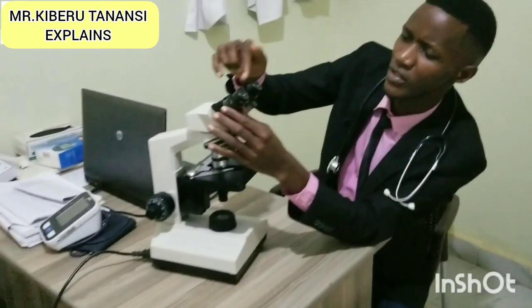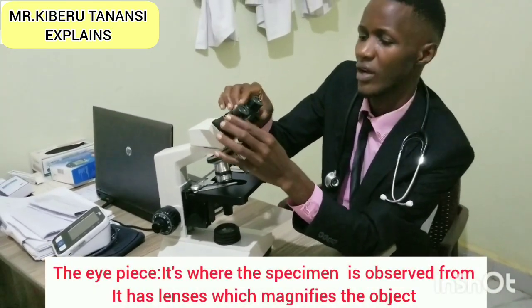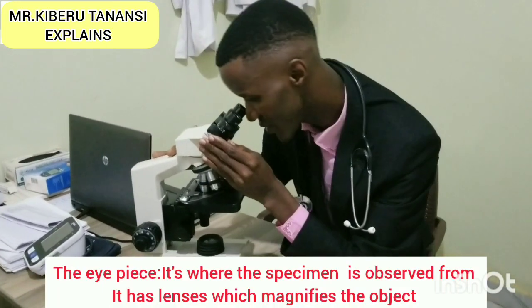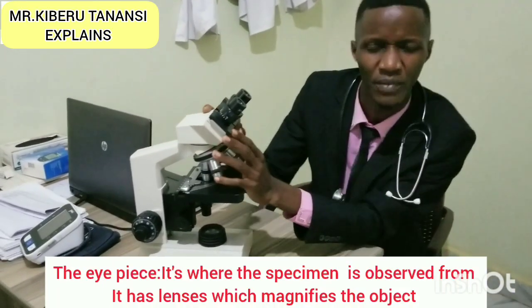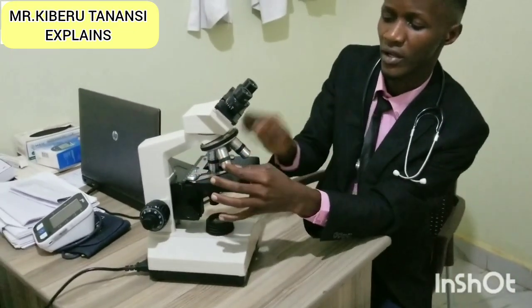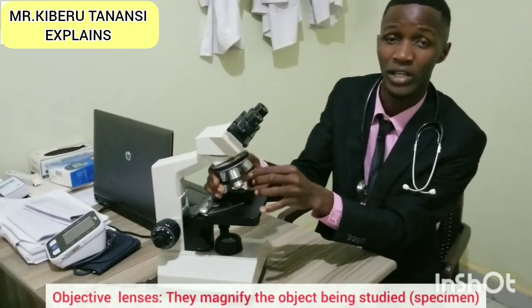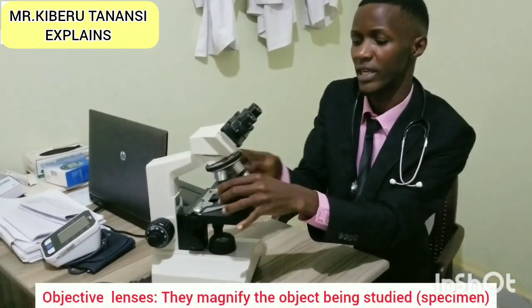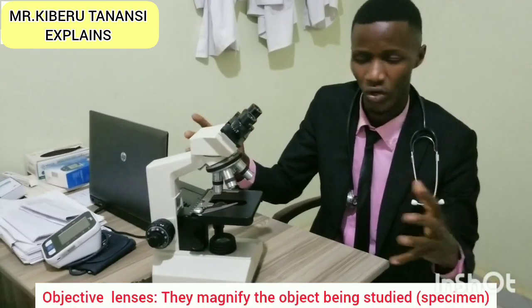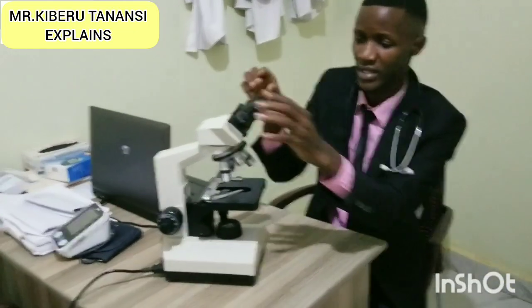So it has these two parts. We call them the eyepiece lenses. We call them the eyepieces. It is these ones. They are the eyepiece. That's where we put our eyes to observe the specimen. From the eyepiece lenses, we have these objective lenses down here. These ones I rotate. They are called the objective lenses. Inside there, they are lenses which help to enlarge the image or the object which is down here. So these are objective lenses, eyepiece lenses.